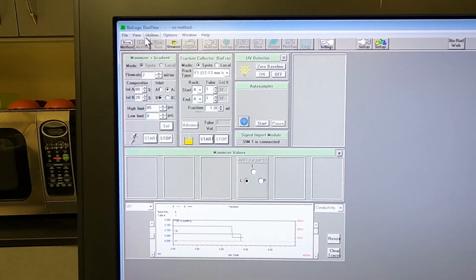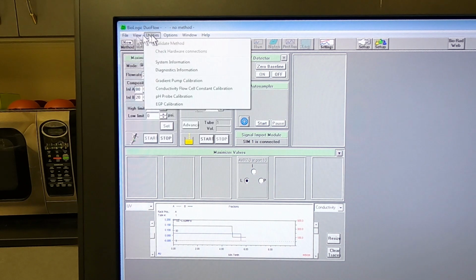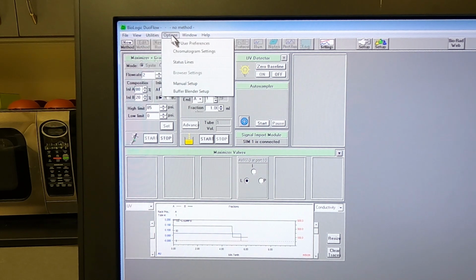And then some other menu options here. Across the top, these are kind of quick navigation buttons. A lot of these menus can also be accessed through the file menus at the top. Utilities, this is where you'll find system and diagnostic information, and also if you want to calibrate anything on the FPLC itself can be done here. So there's our pH probe calibration. Options, so again, this is where you can change preferences and settings.